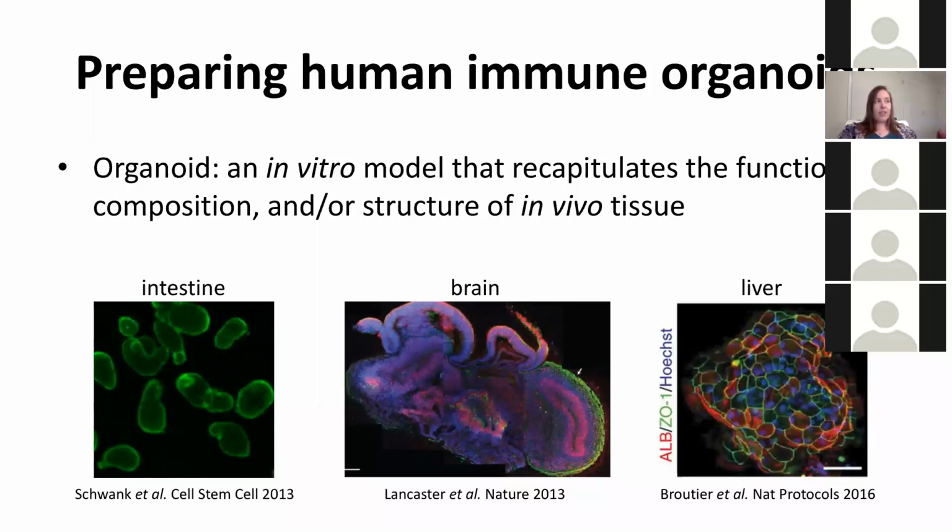So I decided that it was time to prepare a lymphoid tissue organoid. And to do that, I started working with tonsils. The reason why... there are roughly 750,000 tonsillectomies performed annually in the US. And as I mentioned, many of these tissues come from healthy people.